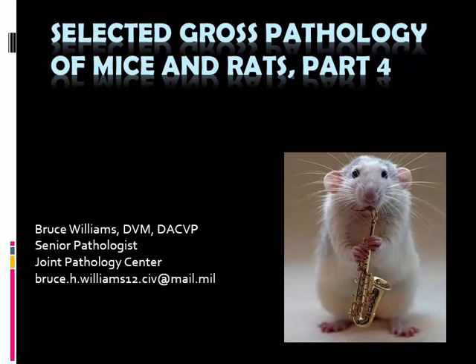Today I'd like to present part 4 of the selected gross pathology of mice and rats, and we're going to talk about the gross pathology of the integumentary system of the mouse.